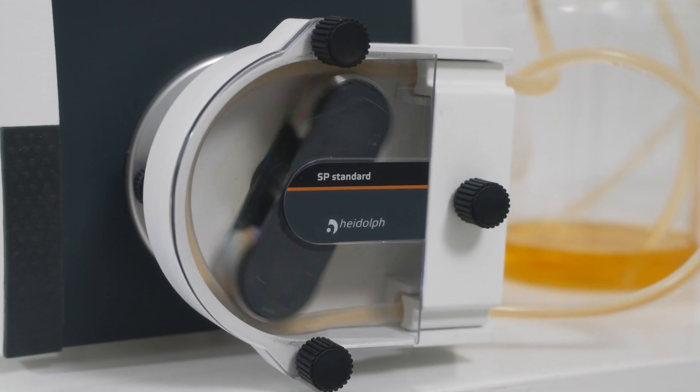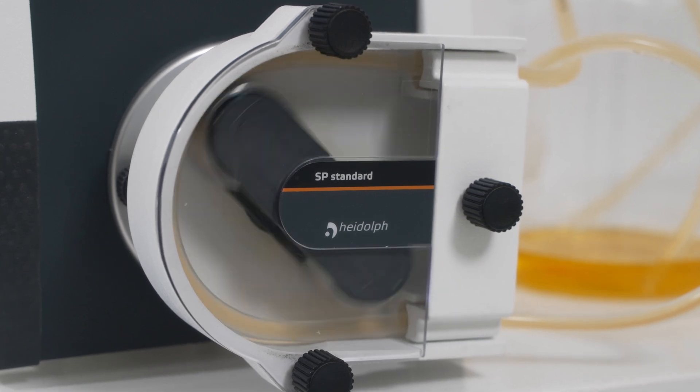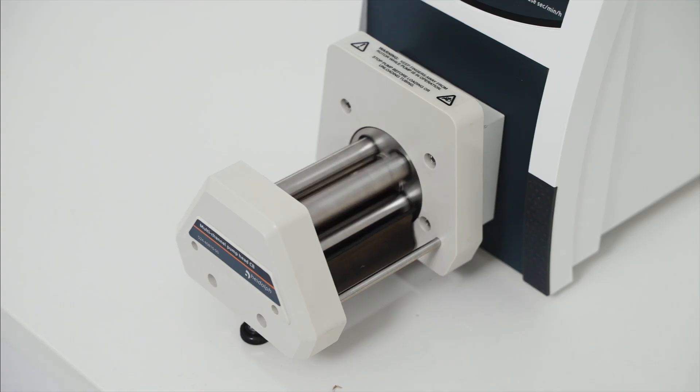The High Flow Ultimate 120 has a control accuracy motor of plus or minus 0.5% and a flow rate accuracy of plus or minus 1%. The High Flow Ultimate 120 can also be adapted to two different types of pump heads: a single channel pump head and a multi-channel pump head.